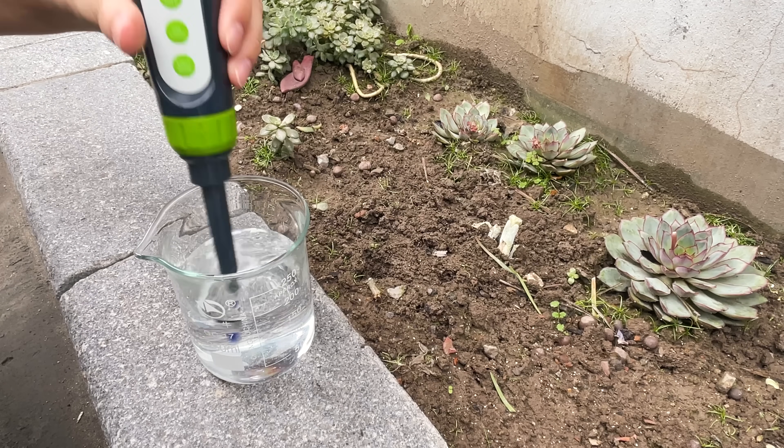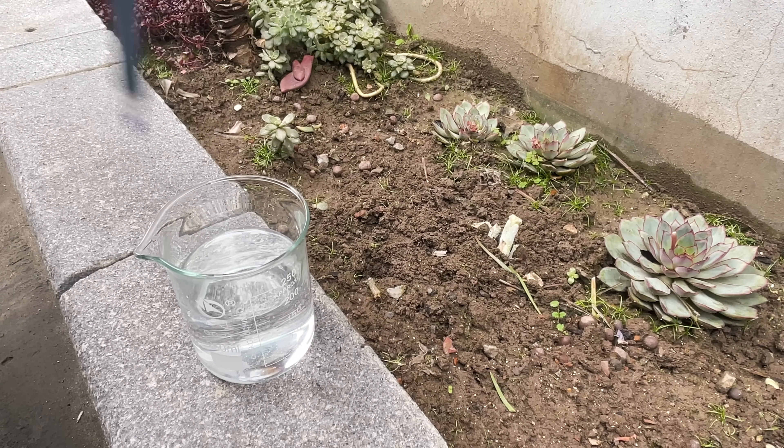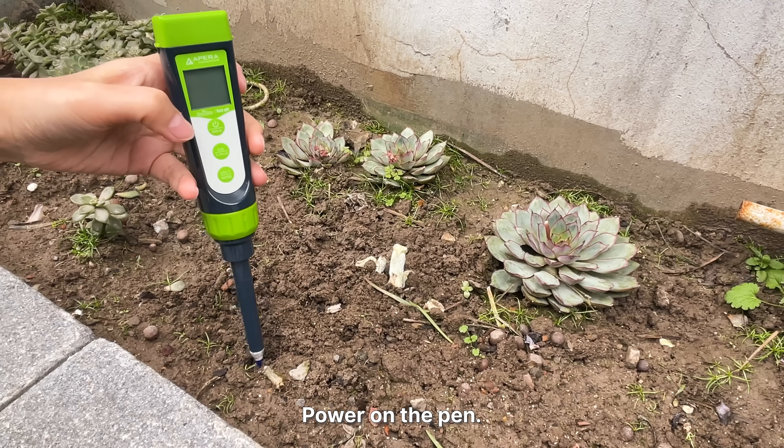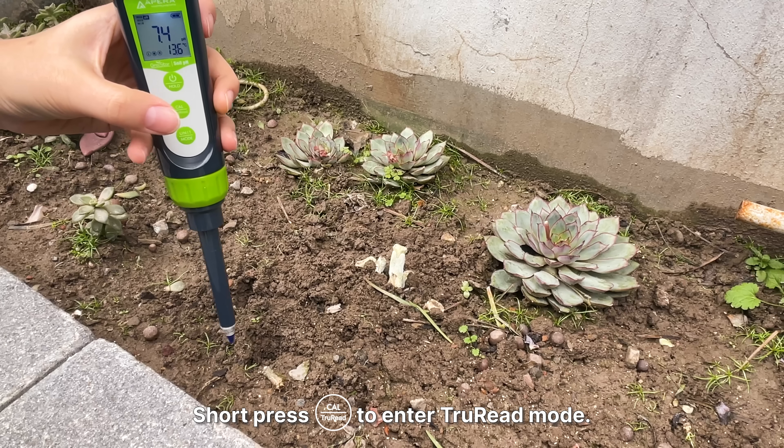Rinse the probe with pure water and shake off excess water. Power on the pen, then short press the TrueRead button to enter TrueRead mode.